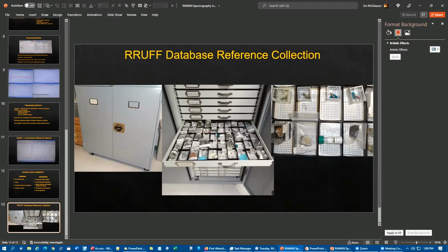And the verified specimens, here you can see on some of these smaller ones, there's a little metal pedestal in there. That's a single crystal mount that we've used to describe the specimen with a single crystal X-ray and a structure. Dr. Young is incredibly good at doing these things. And so the RRUFF database is the final result. And it's a really fun place to work.